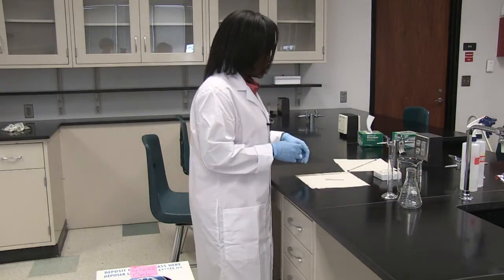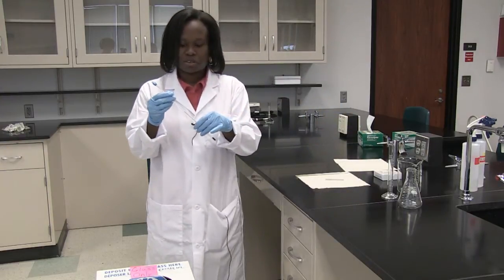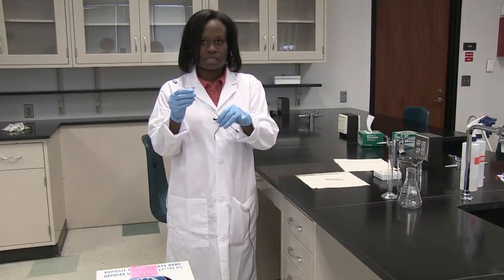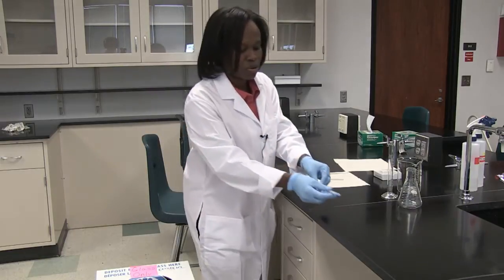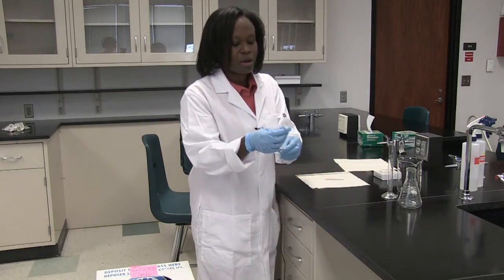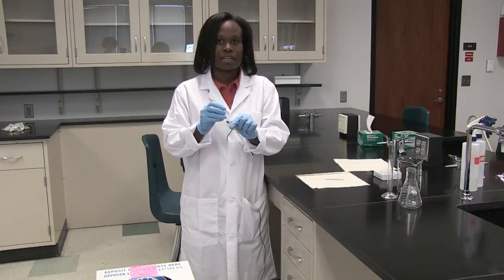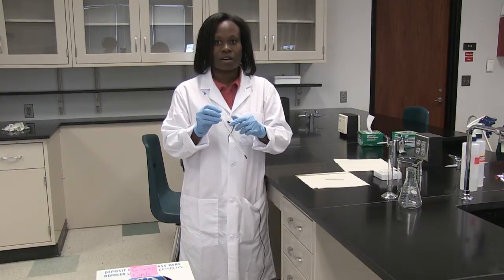Also, when working with the thermometer — this is also a glass instrument — make sure that you do not shake it, and make sure that you don't put it toward the edge where it can roll off onto the ground. Some thermometers contain mercury, so if they fall to the ground then you have a mercury spill, and the instructor would have to clean up the mercury spill.